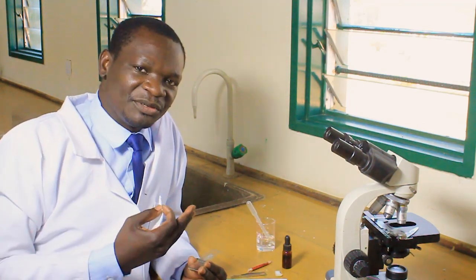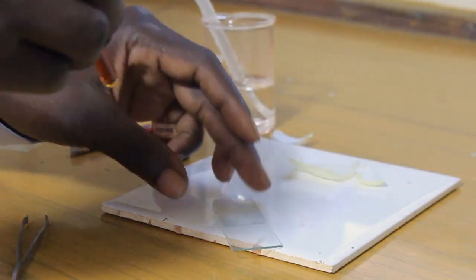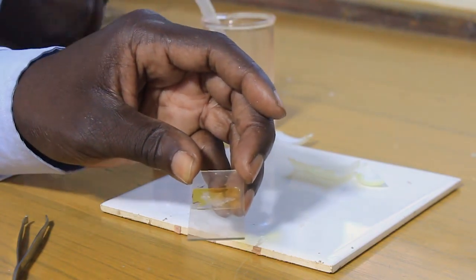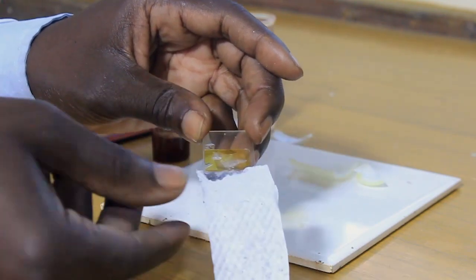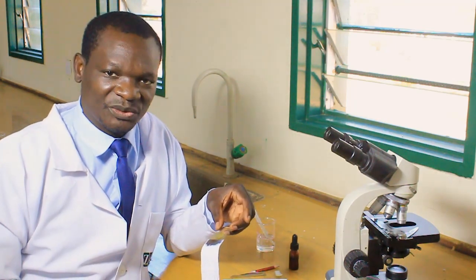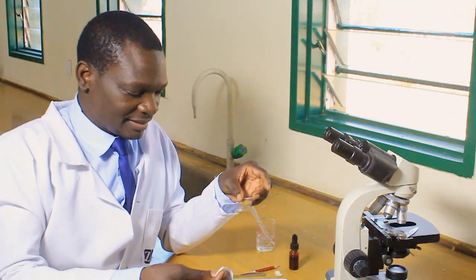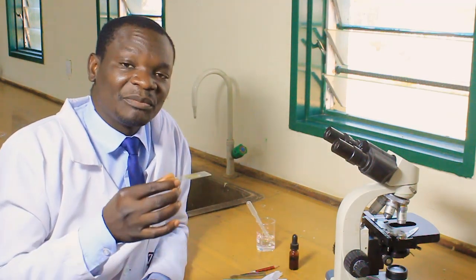That way, we will have a clear view when we observe under a microscope. I have a dropper here. I will put a drop on one edge as indicated — a drop of iodine solution. Then using a paper towel, I place the edge there so that it begins to absorb the water. You can see the water and the iodine solution being absorbed. Once I am satisfied that enough has been absorbed and the specimen is well stained, I have finished preparing the specimen for viewing under a microscope. Remove the paper towel and discard it in the bin. The slide we have prepared can now be placed on the stage.